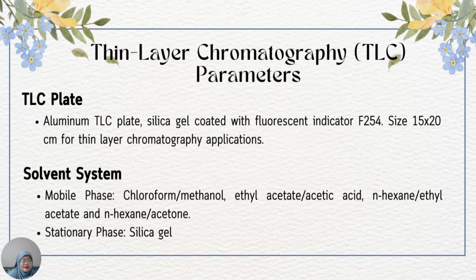I'll be presenting about the TLC parameters. In this study, aluminum TLC plates, silica gel coated with fluorescent indicator F254, were chosen, and we also chose the size of 15 centimeters length and 20 centimeters width for these applications.